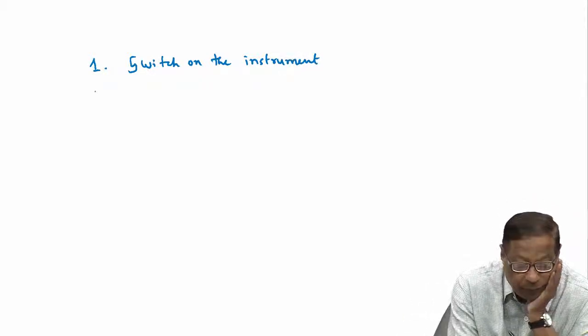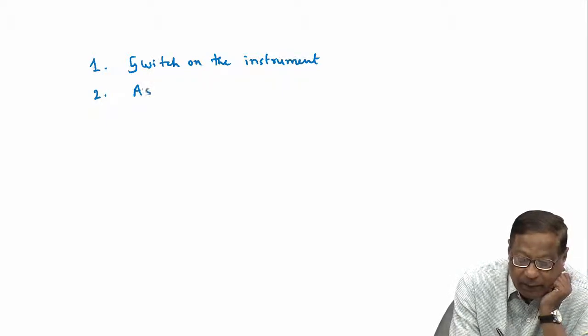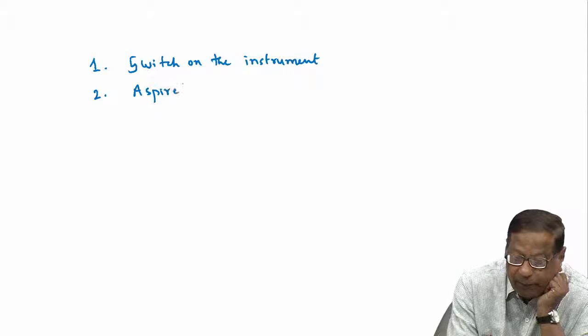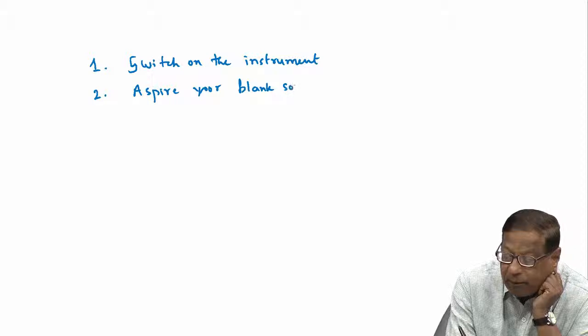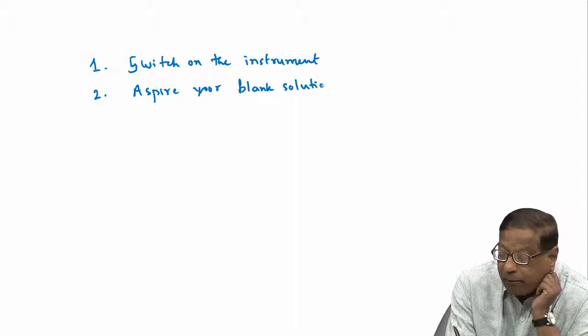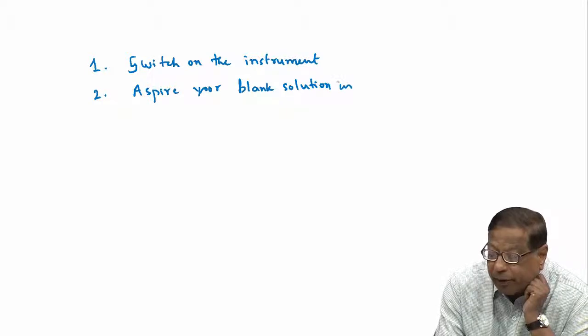Number 2, aspire your blank solution into the flame.